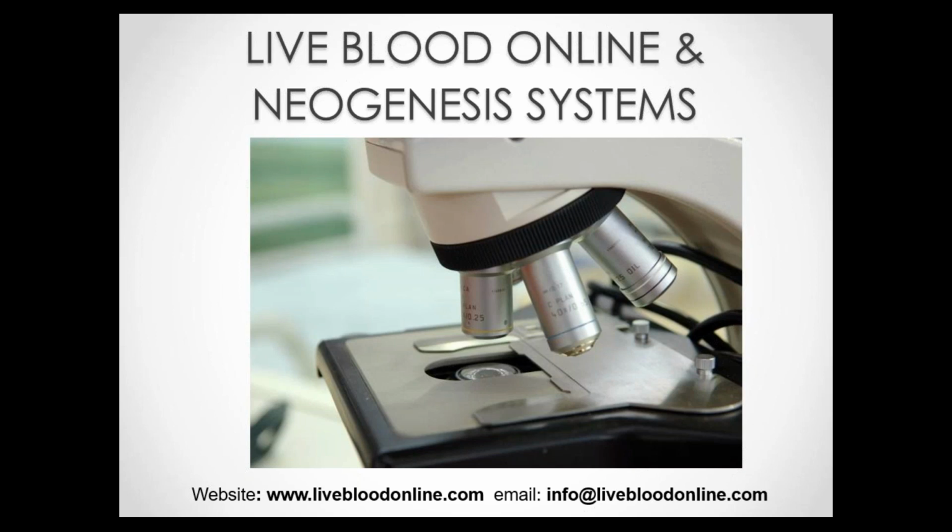Now, the strength of live blood analysis actually lies in what we discussed earlier, in its ability to provide the practitioner and the patient with a glimpse into the patient's internal cellular environment or the biological terrain, and to identify imbalances affecting the terrain that are contributing to the patient's condition, and in many cases were actually instrumental in the development of the patient's symptoms.